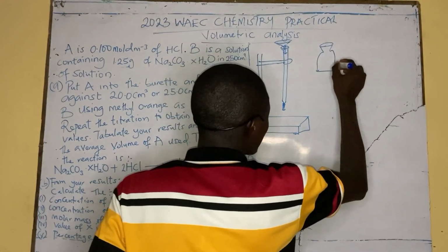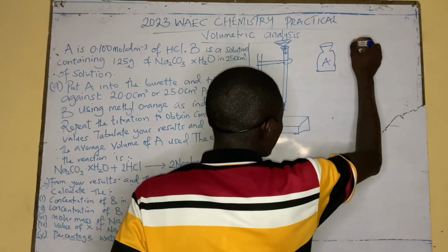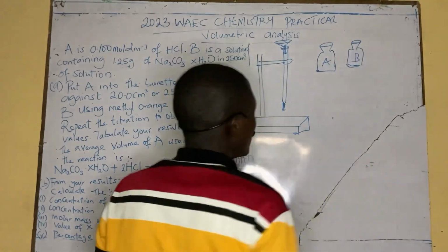Inside what? Reagent bottle, A. And then your base also inside a reagent bottle, as I already said in the other video as well. So we have A and B.